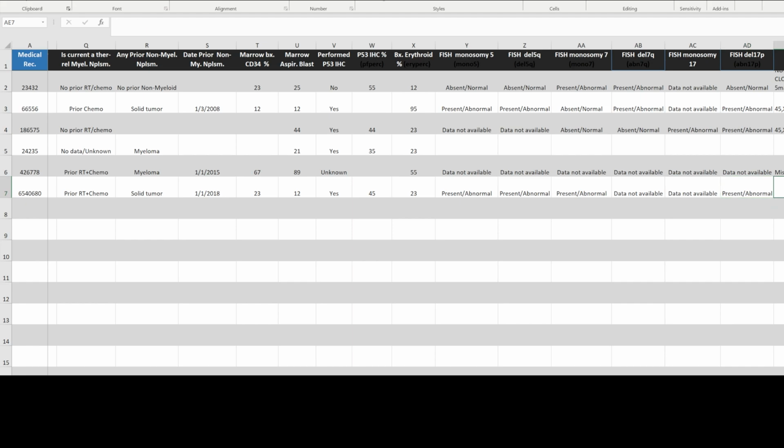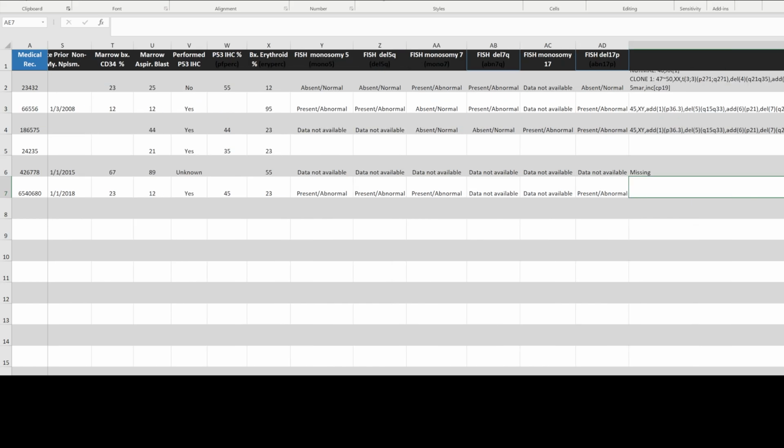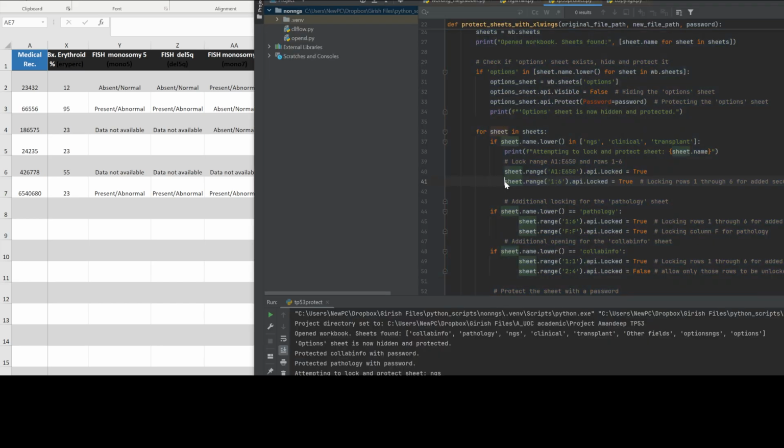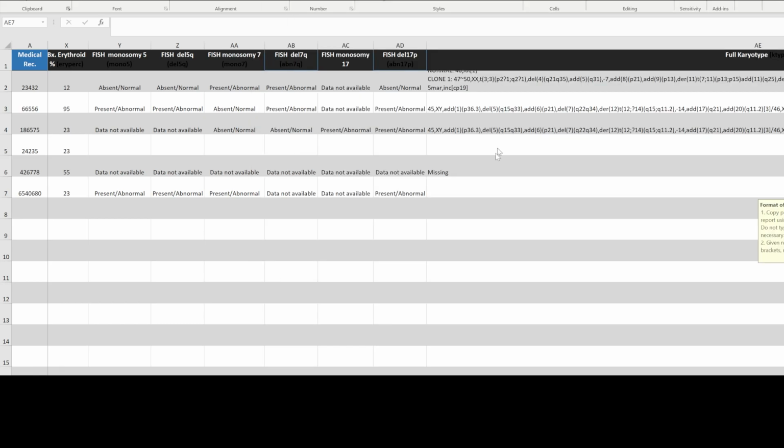And then you move on to the karyotype. Here is where things get tricky, for fields where I'm letting you totally copy paste from the karyotype from your report into this section. So when I pick a chunk of text, let's just pick this random code bit, I want to paste this in that cell for karyotype.